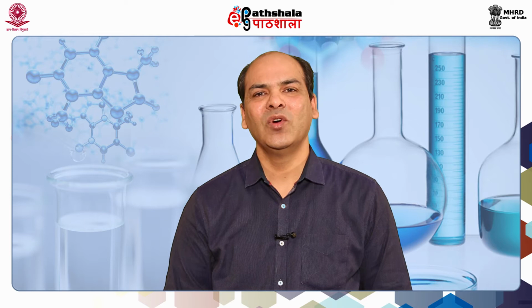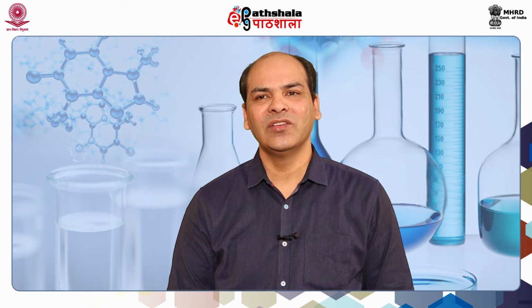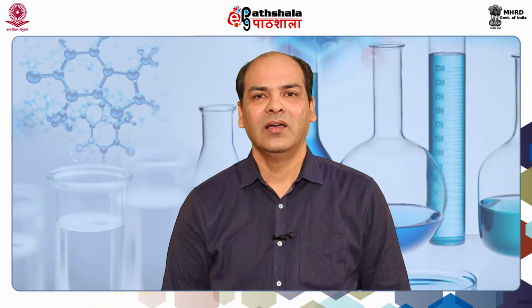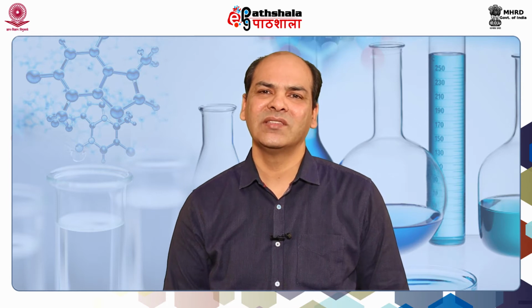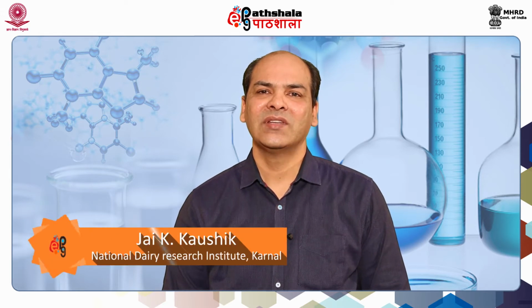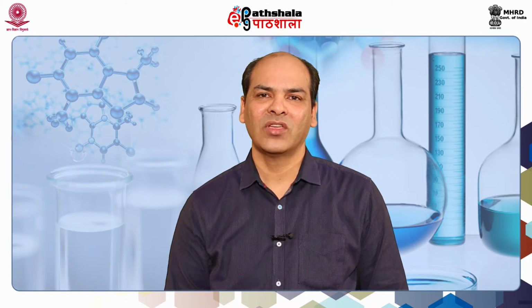In the case of small molecules, it is usually the structural part which we can investigate, while in macromolecules or bigger molecules, it is the conformational part which we analyze with circular dichroism or optical rotatory dispersion. These two techniques have the same origin at the quantum mechanical level. So we will start with the two objectives that we'll be talking about in the next slides.